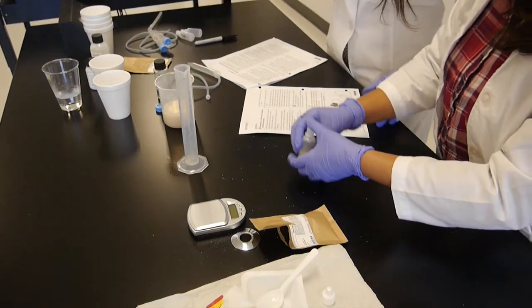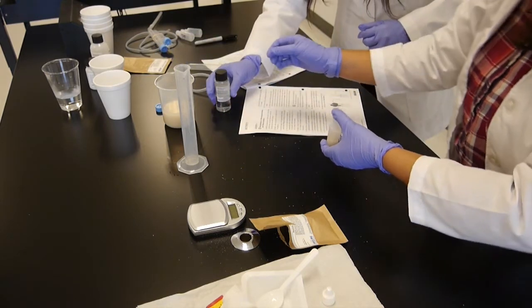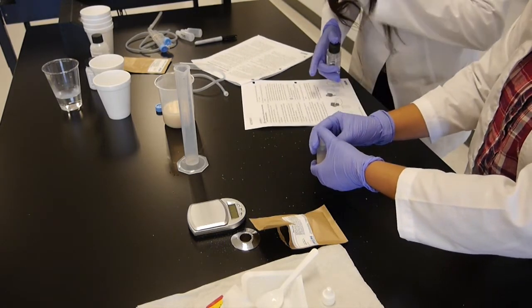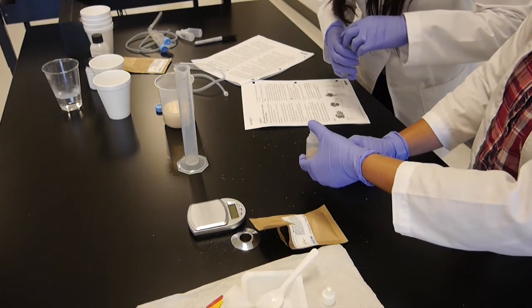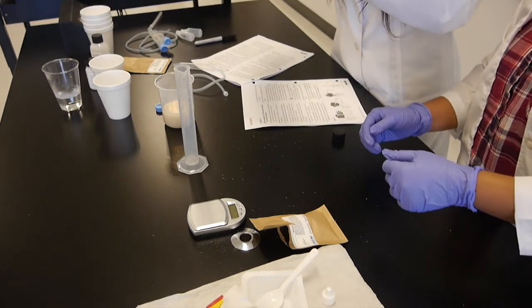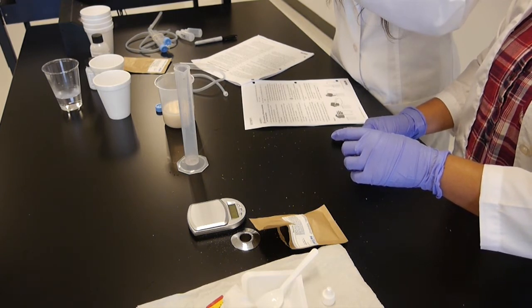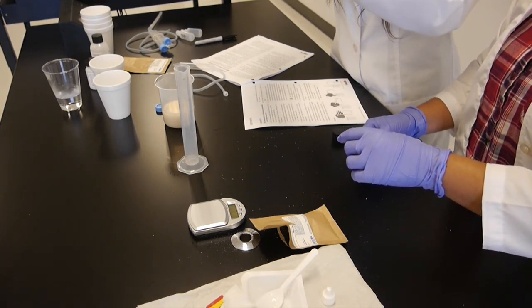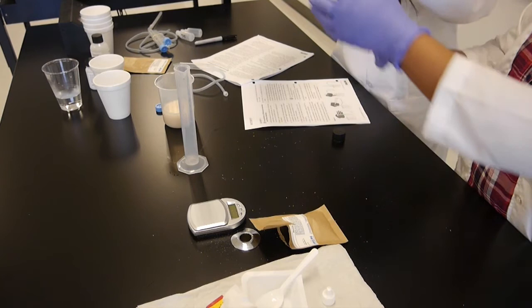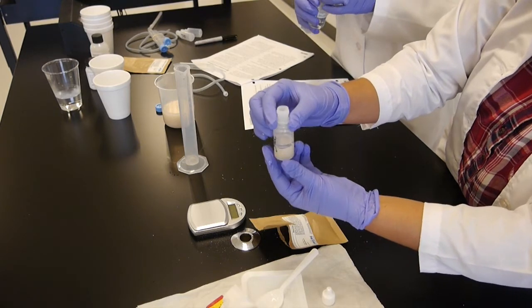And let's add a little bit of oil in it. So here's the oil. It needs to be about half a centimeter. And then it says be careful not to mix it. So very carefully, gently we're going to create an oil layer. So the oxygen, we cut off the source of the oxygen. There you go. So this is how we created an oil layer.